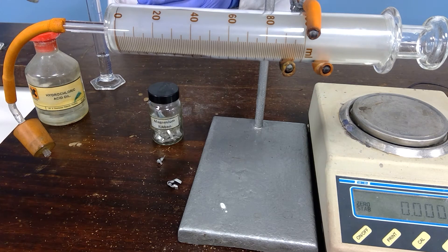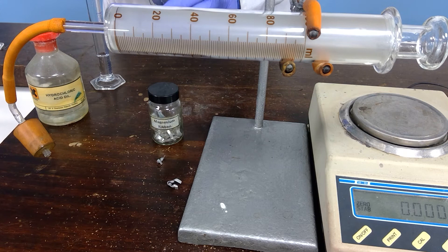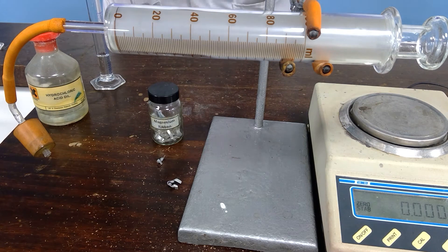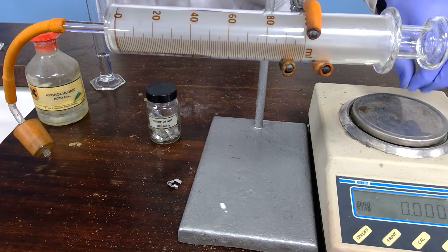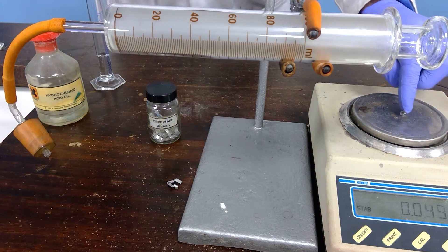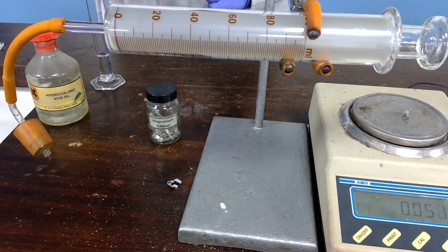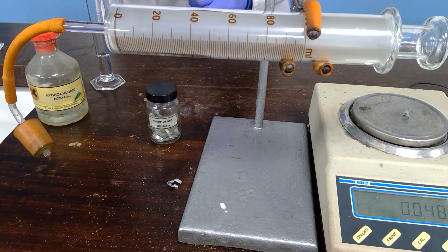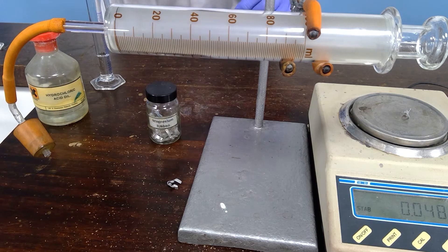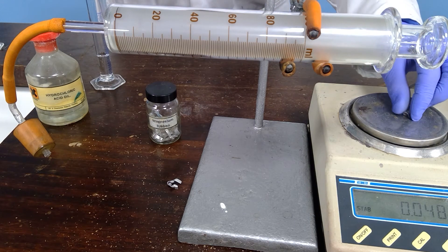For this second experiment, let's use the second size of magnesium. Again making sure that's at zero, let's take the mass of the second piece of magnesium. Okay, we have that.